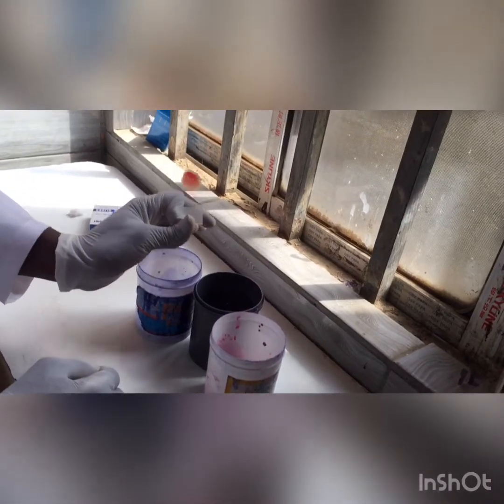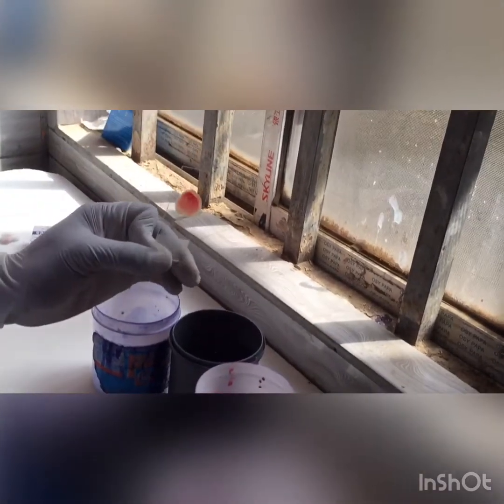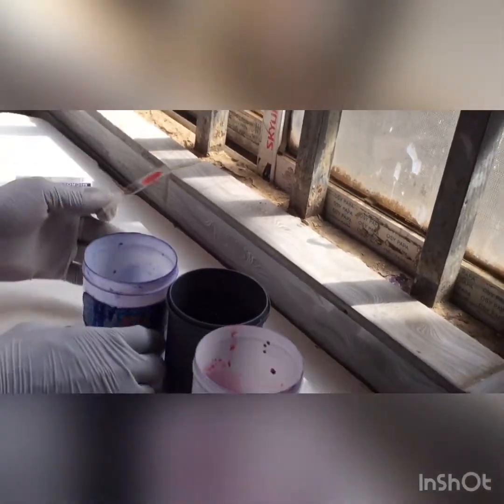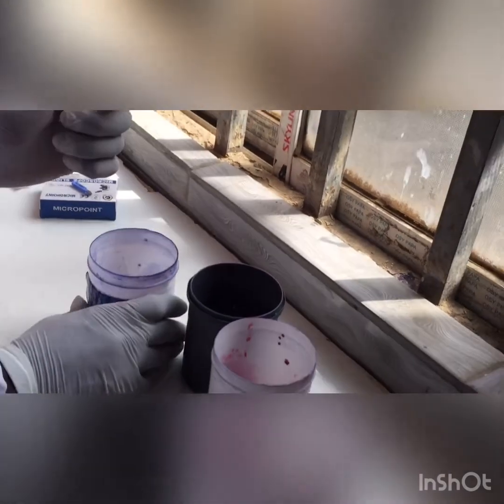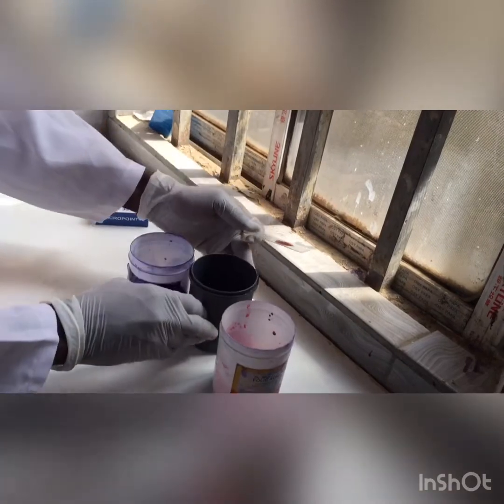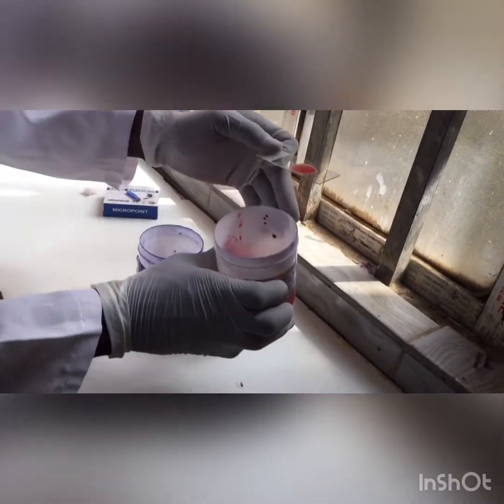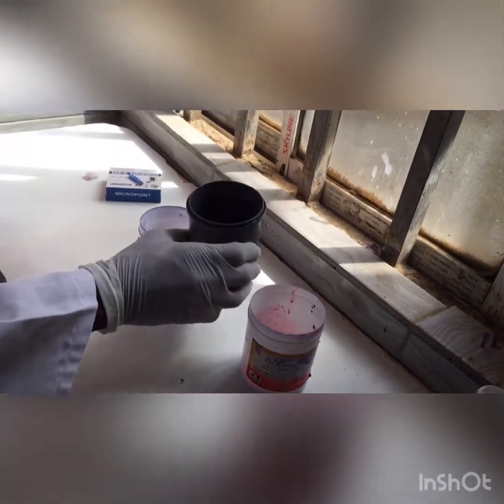After allowing my thick blood smear to dry for about 10 minutes, you can see it's very dry. So now I'm going to dip it into my Field stain A for about 3 seconds, do the same thing in my clean water, then remove. Do the same thing in my Field stain B, remove, and then do the same thing again in my water for 3 seconds.